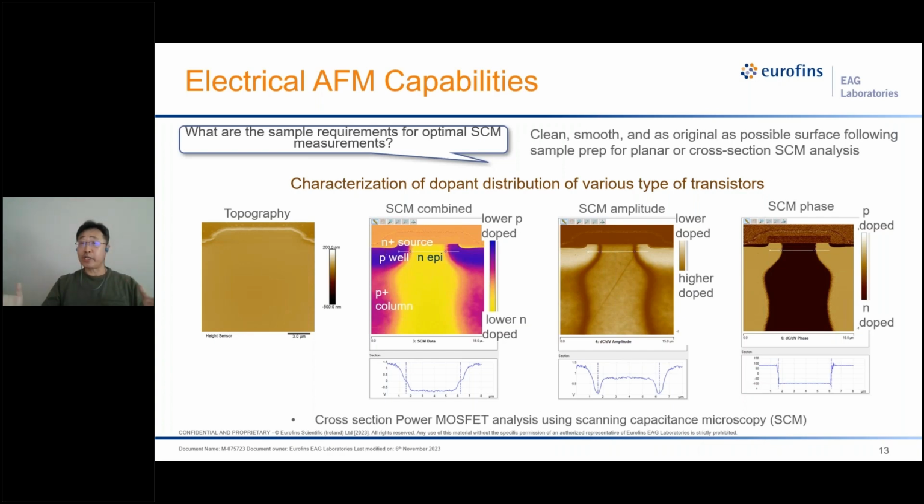Nevertheless, from both profile shapes, one can tell that the N and P carrier amplitudes annihilate each other and become neutral at the identical location where the N to P phase transition occurs. In short, the scanning capacitance data contains a wealth of doping distribution information, including carrier accumulation, depletion, and inversion around differently doped interfaces. It's a powerful failure analysis technique, unrivaled by any other method spatial-resolution-wise, for mapping active charge carrier distribution.